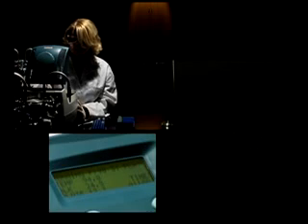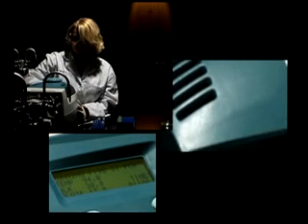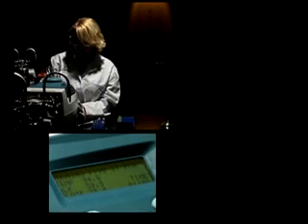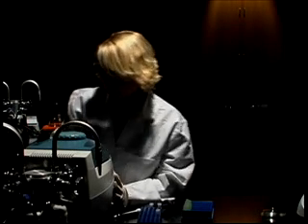The polymerase chain reaction takes place in a thermocycler. Initially, the tube will be heated to 94 degrees for 5 minutes. It will then be run through 32 cycles of 94, 65, and 72 degrees, each lasting 30 seconds. Finally, the tube will stay at 72 degrees for 4 minutes.